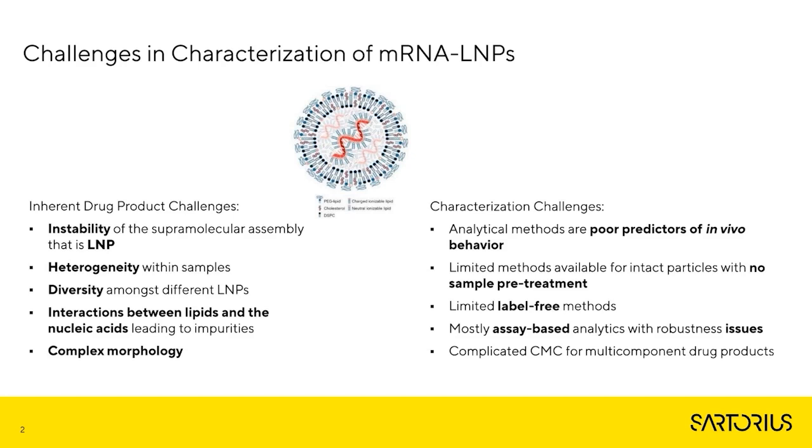So what we get as our analytical and characterization results is not the whole picture. Or we are changing the system too much by wanting to look at the particles.